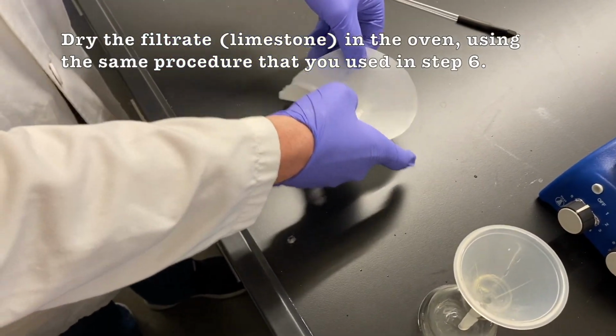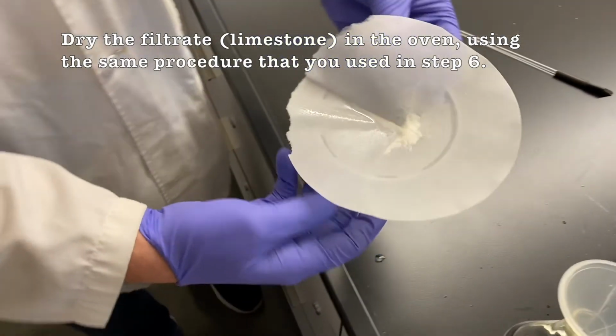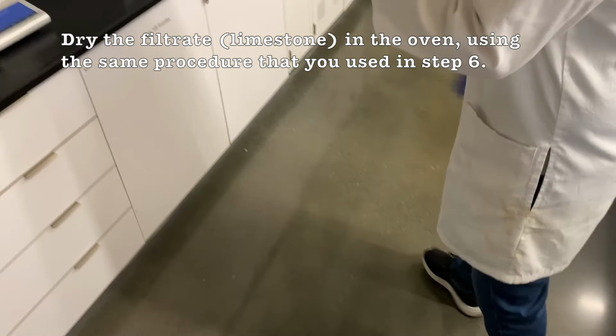So we'll do the same thing we did for the sand. We'll dry it off, and then we'll take a mass of it. Two masses. Great. I love it.